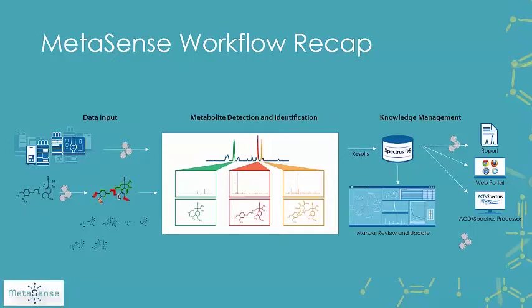we first use the accurate mass and theoretical isotope patterns to detect potential metabolites. Then we extract out the MS2 spectra and compare the spectra between the parent and metabolite, as well as incorporating some physiochemical property prediction to elucidate a discrete structure. Once the data is processed, all the results get uploaded to Spectrus DB. That is our databasing platform.